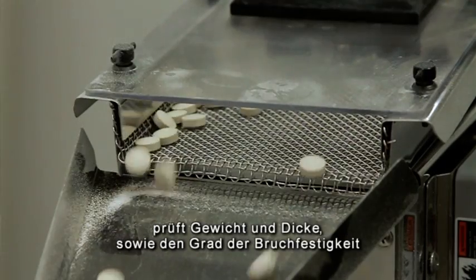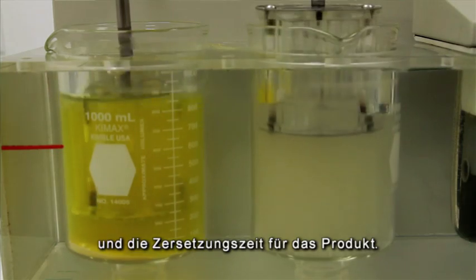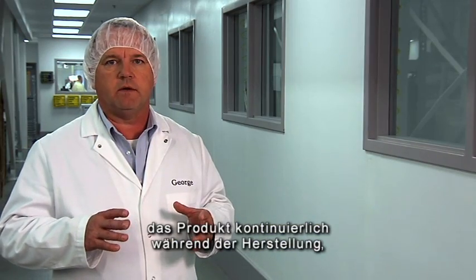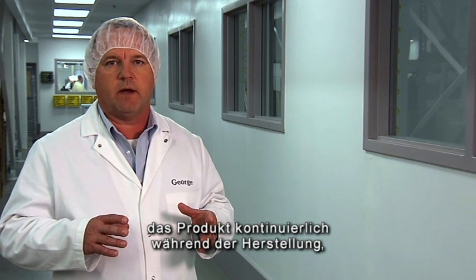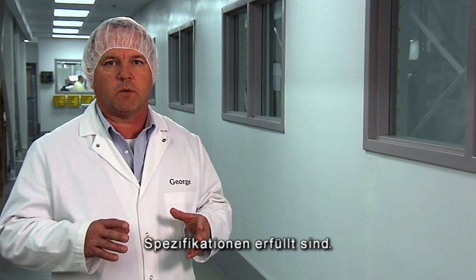Quality control will come in every 30 minutes, collect their own sample, verify weight and thickness, and again check friability and disintegration as required for the product. This process continues with both production and quality control continuously testing the product as it's being pressed to make sure that all the specifications have been met for that particular product.